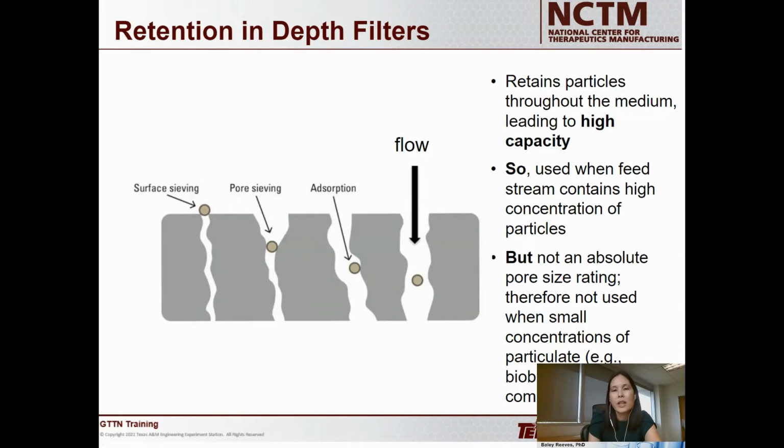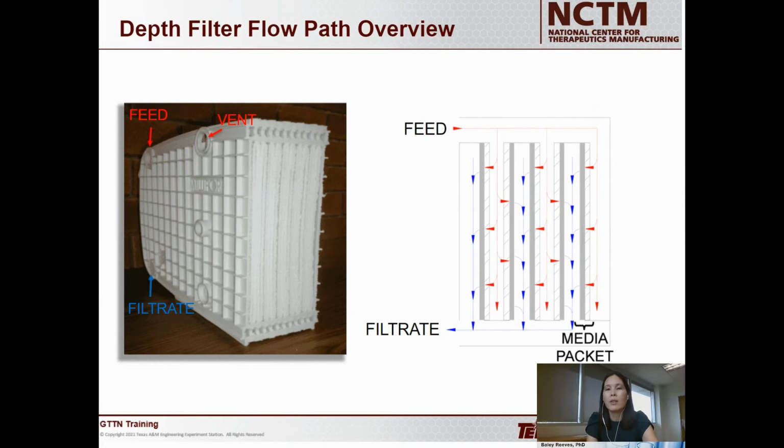An alternative to centrifugation is depth filtration. So depth filtration is just a filter. And the special thing about depth filters is that they have very high solids capacity compared to your surface filters, which have very low solids capacity. So essentially, you're feeding your material, which again is this mixture of solids and liquids, through your depth filter. The depth filter will capture all of those solid particles, and the clarified liquid will flow through that filter and can be collected.